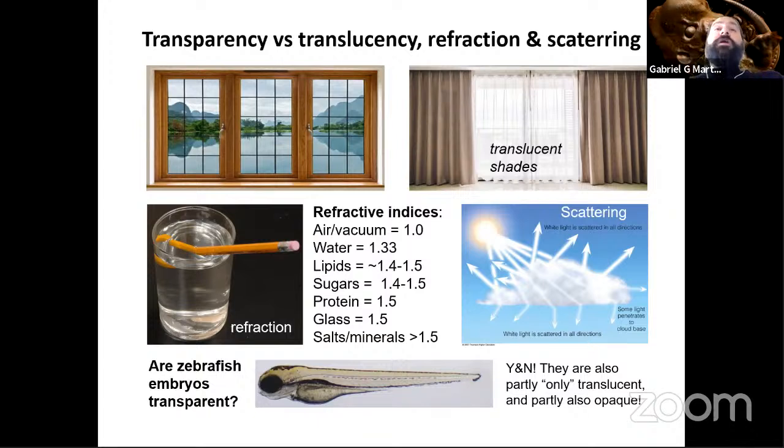That's because they are in fact very transparent, but once you start piling up cells on top of other cells, and you're looking at not just individualized cells in culture, but a whole multi-layer of an organ or organism with multiple layers, you realize that even though individual cells can be quite transparent, a bunch of cells clumped up together make up a tissue that is actually more translucent than transparent. And that becomes a challenge if you're interested in studying tissues and cell organization and tissue organization.